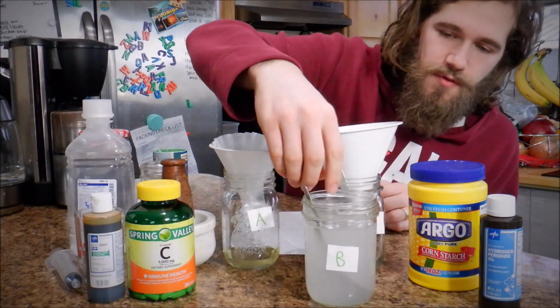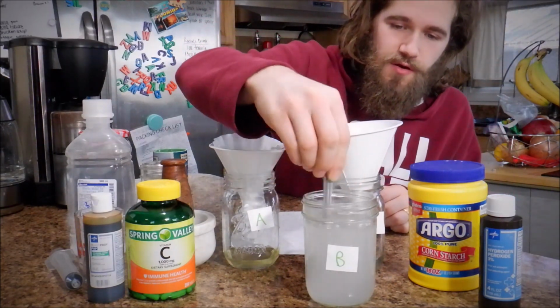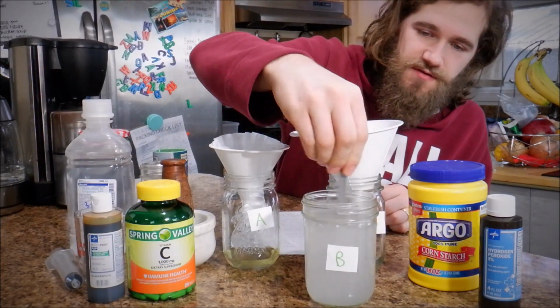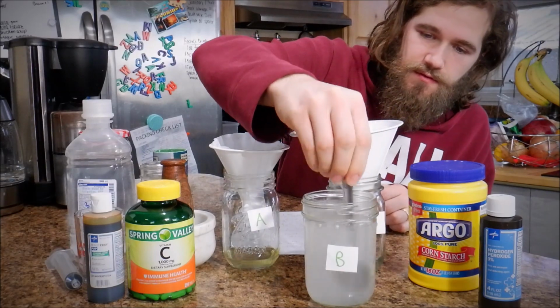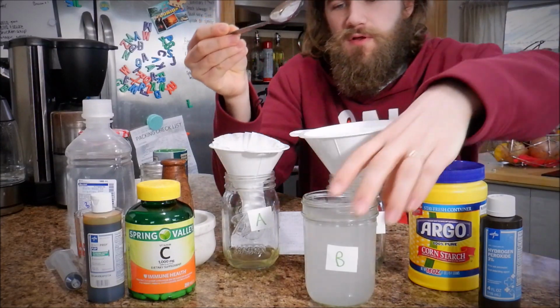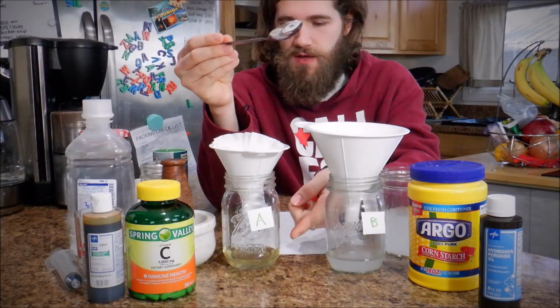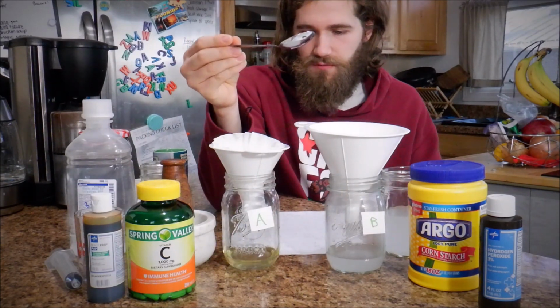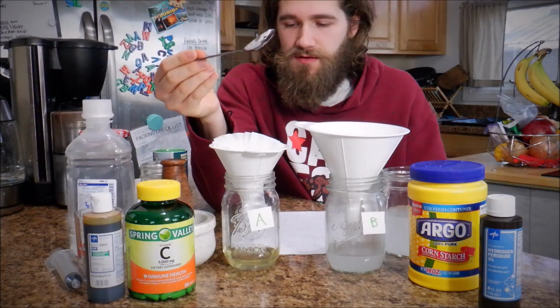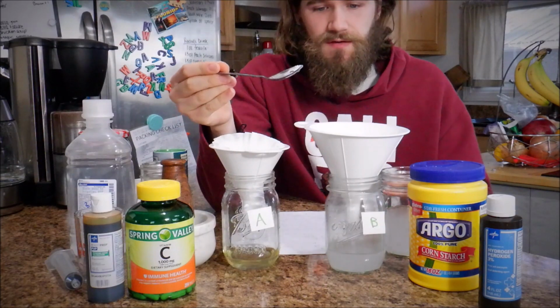Alright, so I have heated up the start of solution B already, which is that little bit of cornstarch and about 350 mLs of distilled water. And it is a little cloudy, so what I will do is I will filter it through this coffee filter. And as you can see already, solution A that we have started with the ascorbic acid, which is the vitamin C, and the distilled water is starting to clear up nicely.